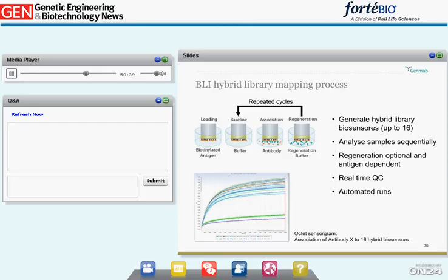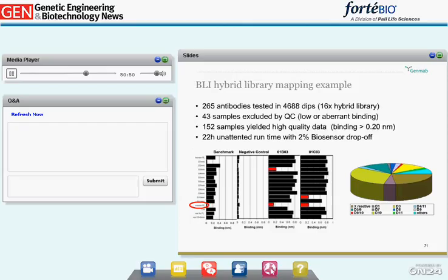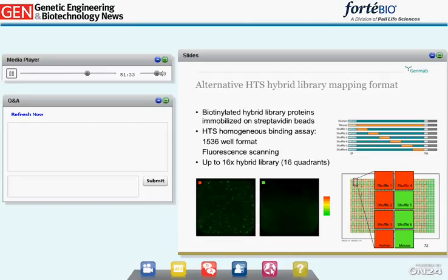A typical sensorgram of a 16-construct hybrid library shows two binding curves — one showing no or reduced binding to the full-length shuffled species protein, and one of the shuffle constructs. In a hybrid mapping case study, we analyzed a panel of 265 antibodies by a 16-construct hybrid library in 4,688 dips. Results for 43 antibodies were rejected as not passing quality criteria. This analysis took 22 hours of unattended runtime. In this case, 12 independent binding groups or bins were obtained.